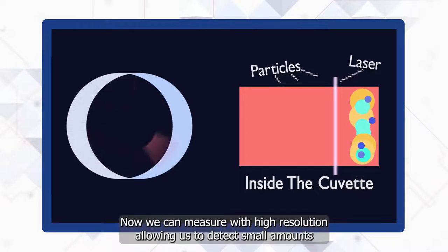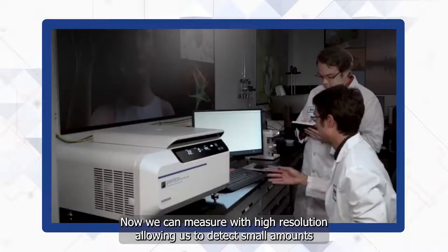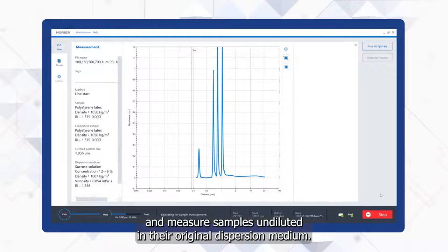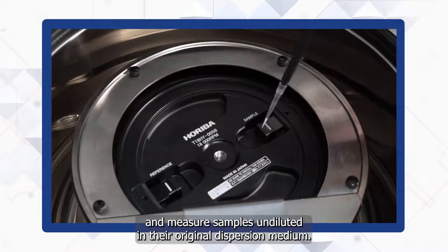Now we can measure with high resolution, allowing us to detect small amounts of agglomerates, differentiate peaks from multimodal samples, and measure samples undiluted in their original dispersion medium.